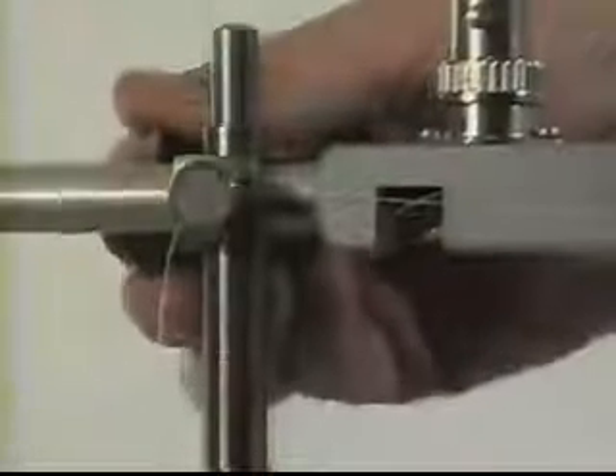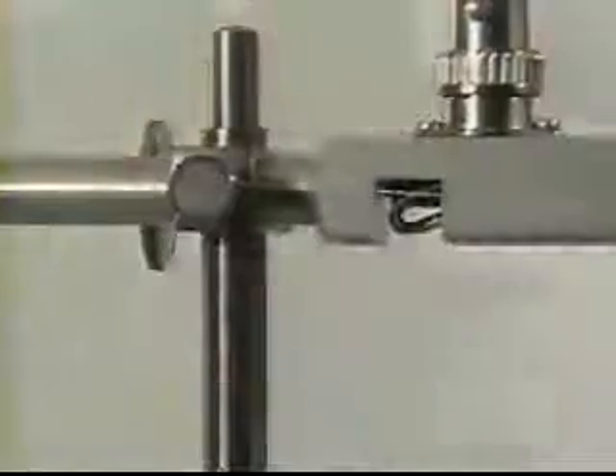If using an isometric transducer, it is usual to apply tension by racking it to a height that stretches the ileum approximately a further 50% of its original length.